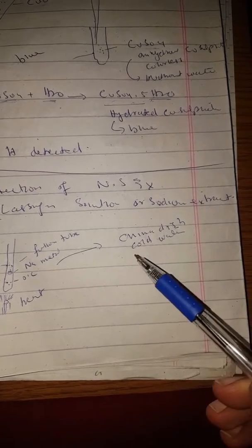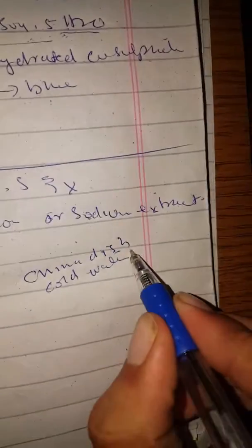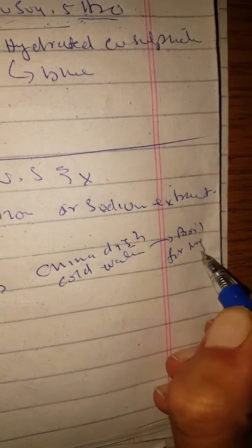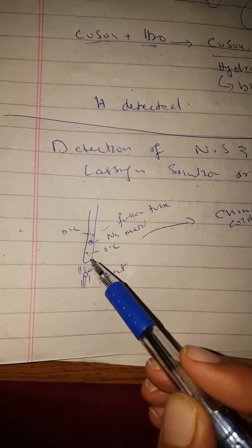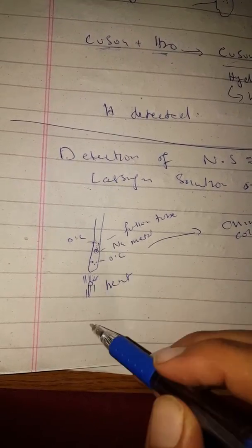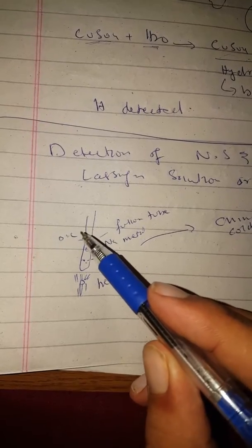When we put the fusion tube in the china dish it will break. Then we put it under the spirit lamp and we will boil it for a long time. We put the sodium metal piece and the organic compound together and heat until red hot.